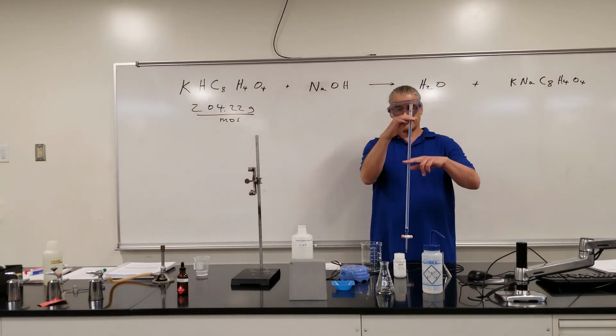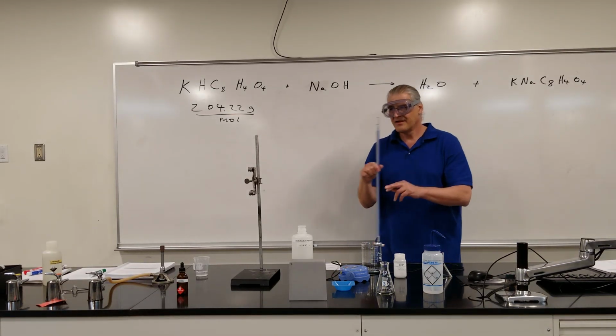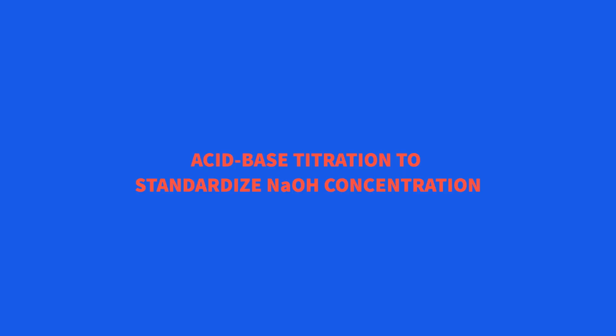Drain it down till you want it. You know that final volume. The total volume that came out of the burette is the final minus the initial. There's absolutely no need to start at 0. So our burette's ready to roll.